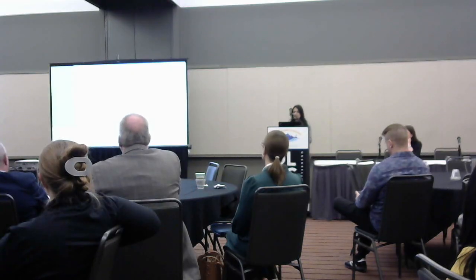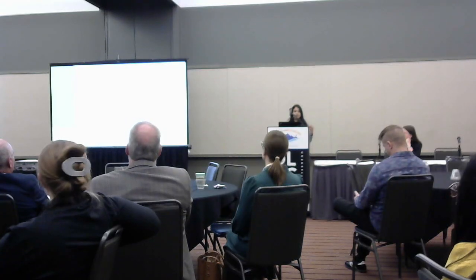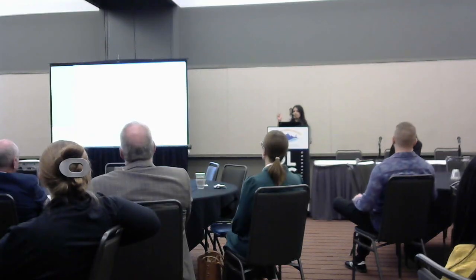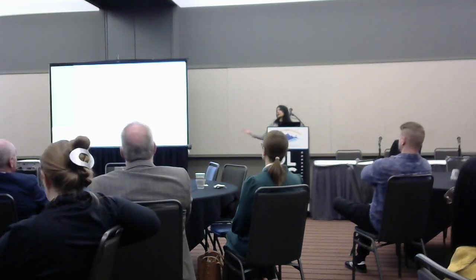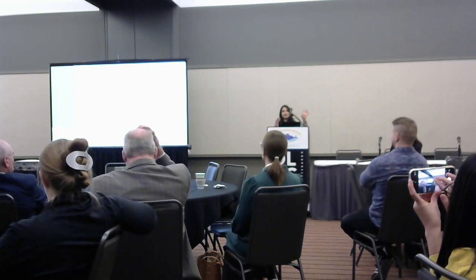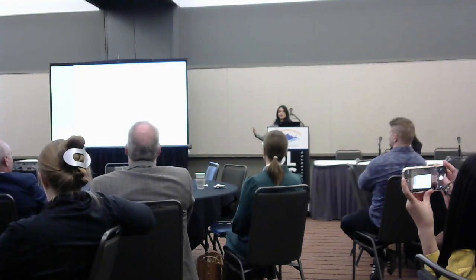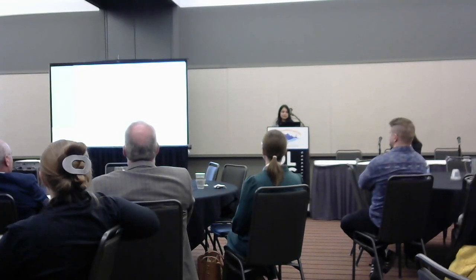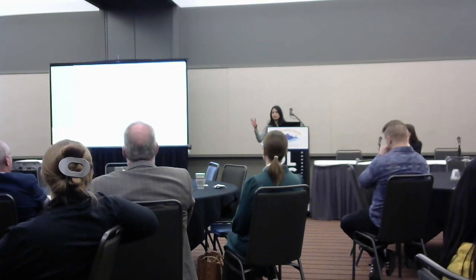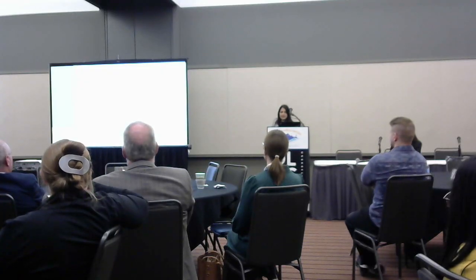Another example that we are currently working on is light sheet image processing. For each light sheet image, the raw image has some streaks that need to be removed post-acquisition, and that's called destriping. And most of the light sheet images are multi-tiled, so you need to stitch them together before you do any segmentation or registration and analysis. So what we started doing was we identified the common workflows which are going to be usable for all our users. That includes the destriping and stitching.